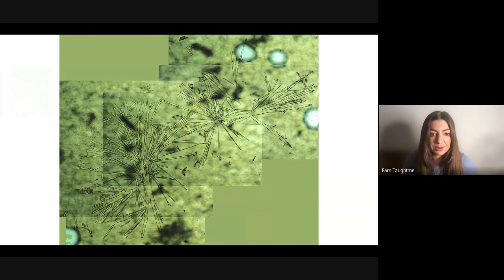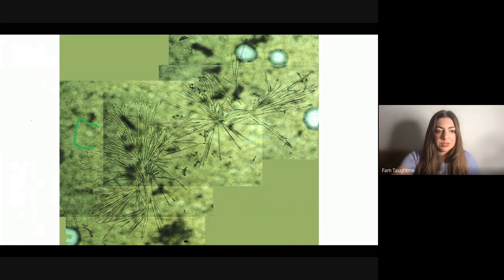I ended up making this composite image. This is by and far the largest observation that I got throughout the entire thing. And it was on the very last cycle day. And yeah, again, here's like a normal size fern. So really wild.